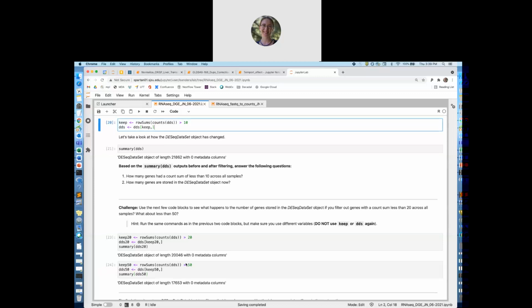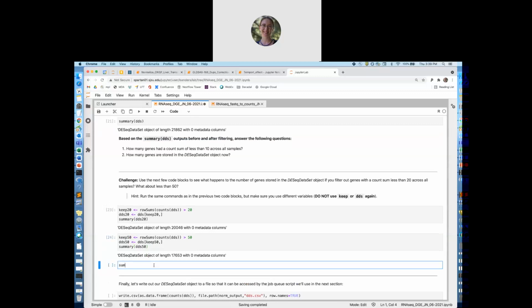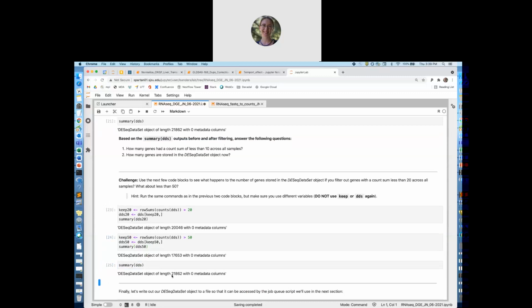Let's everybody create a new cell here, please, and run summary DDS. And let's everybody make sure that we are still getting 21,862 when we run summary DDS. Make sure nobody has overwritten their DDS object. All right, thumbs up. I like that. Perfect.